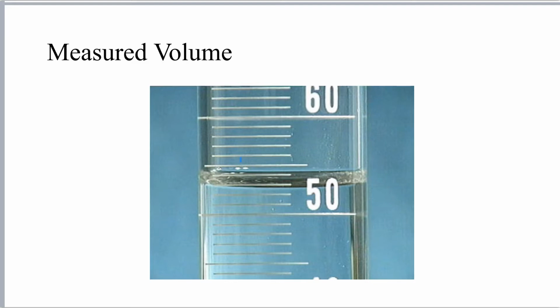We call that surface a meniscus. So meniscus is literally like a skin, so maybe I'll write that in red. Meniscus. And when we look at it, we always want to look at it side on, and we want to be level with the bottom. So we're going to look at it side on like so, and we can see the very bottom is right about here. So I'm taking this as being the very bottom, the dark portion.